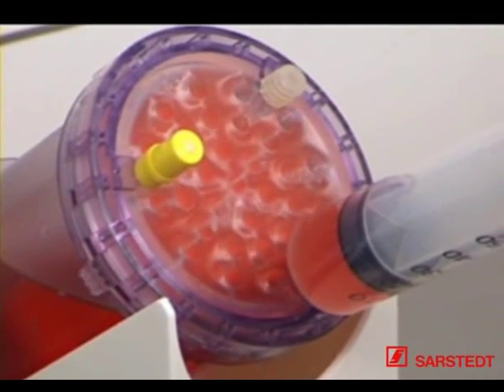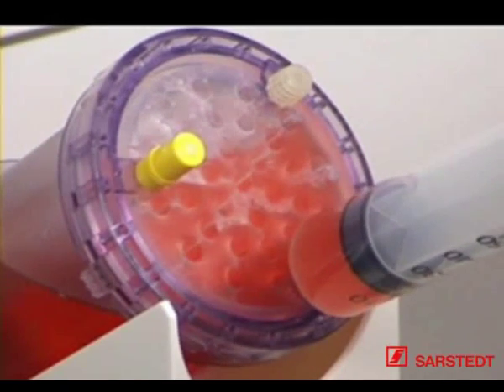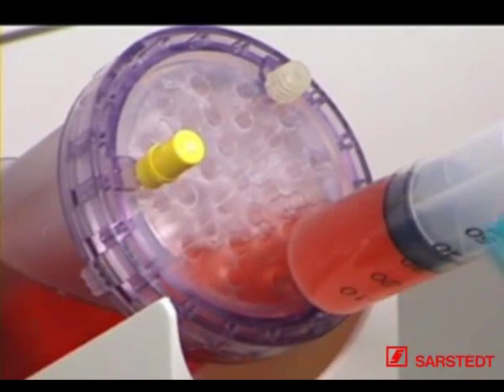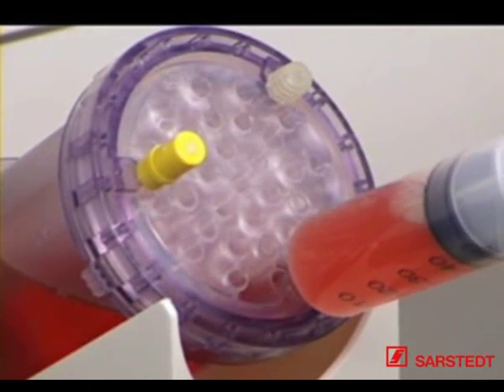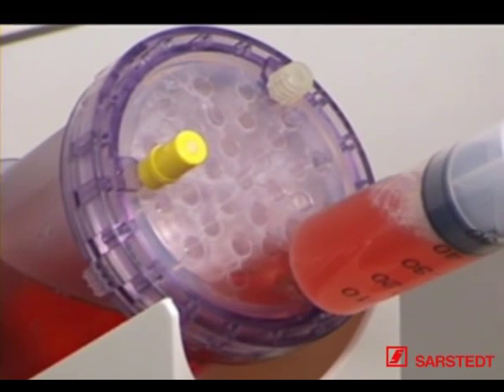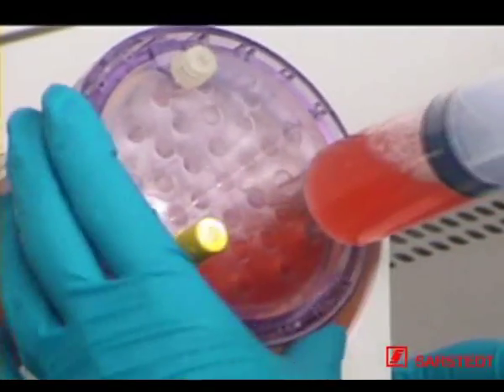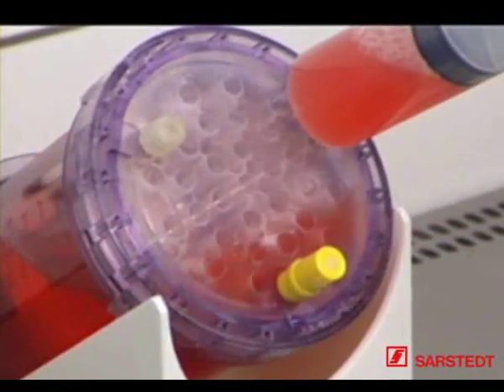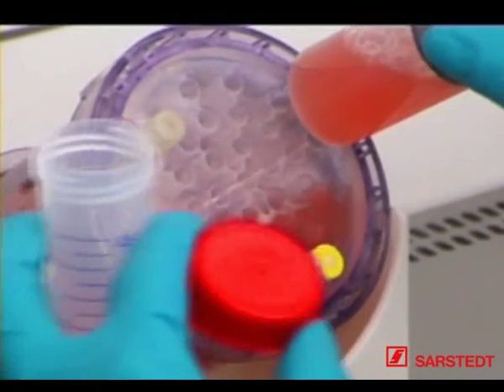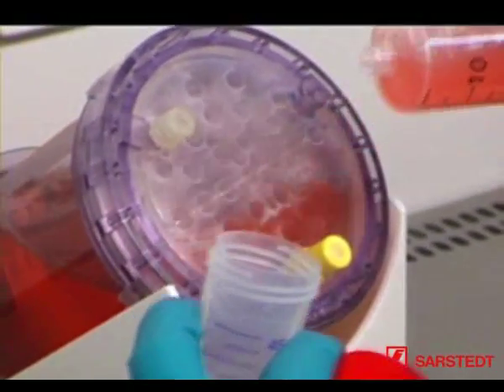For harvesting, the screw cap on this opening should be loosened to prevent negative pressure in the production module, and firmly tightened again after the harvest. Turn the bioreactor until the harvest port is located at its initial position. Remove the syringe and transfer the cell culture supernatant you have harvested to a sterile container.